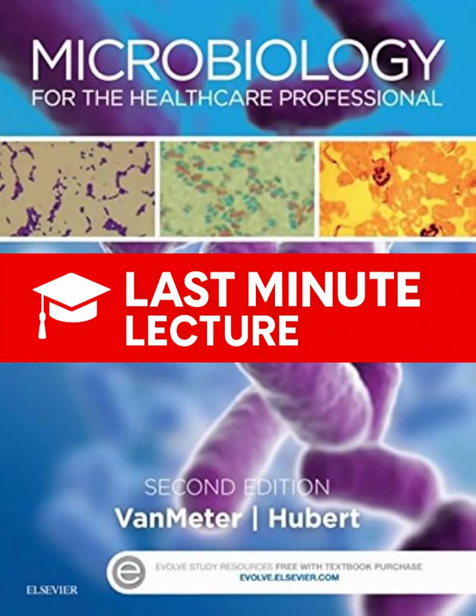Ah, okay. And differential media. That sounds like it shows differences. Yeah. Exactly. Differential media lets different types of microbes growing on the same plate look different, usually based on some biochemical reaction, often shown by a color change. MacConkey agar is the go-to example here. It contains lactose and a pH indicator dye.